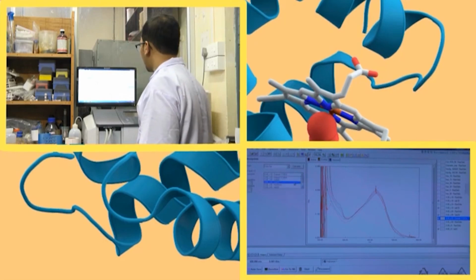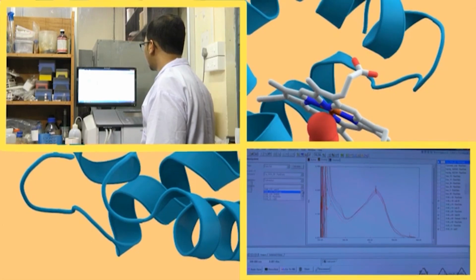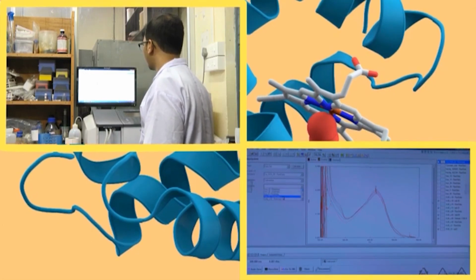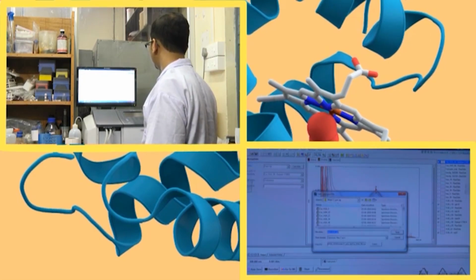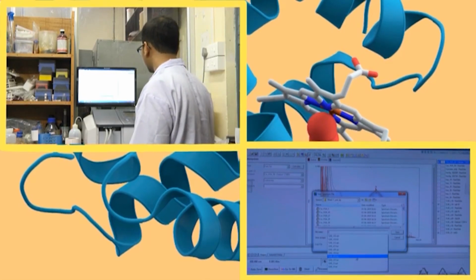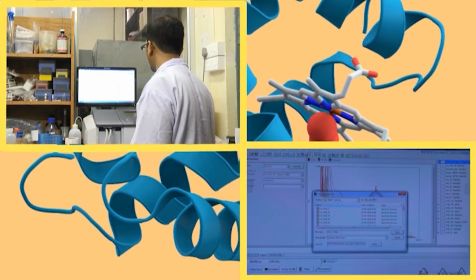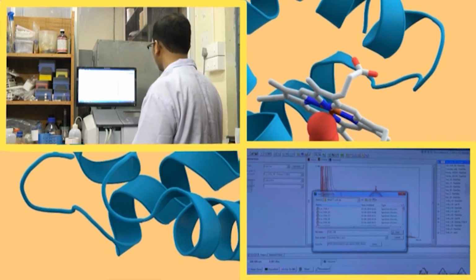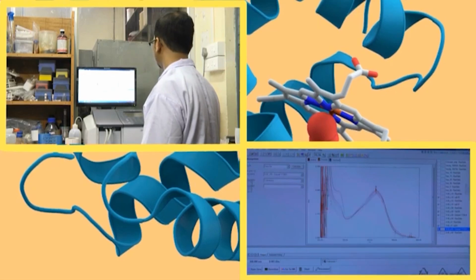And finally we have curcumin HSA 50, and we will subtract it from HSA 50. So, let us save this one again as, not text file, this is curcumin C 50 sub C 50. Save as this one. Okay.